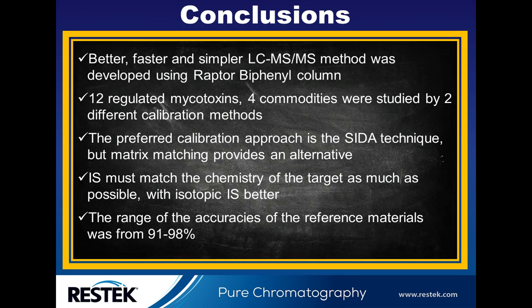And here comes the conclusion. We developed a better, faster, and simpler LC method using the Raptor Biphenyl column, and the total analysis time is only 5.5 minutes. The 12 regulated mycotoxins in 4 different matrices were studied by 2 different calibration methods. I still prefer SIDA, stable isotope dilution assay, over other methods because it's more accurate and easy, although you probably need to spend some money on the internal standard.